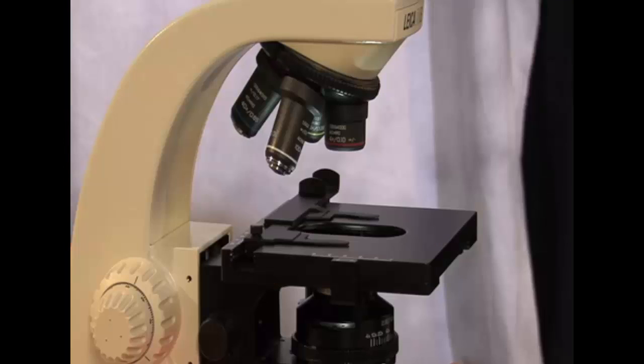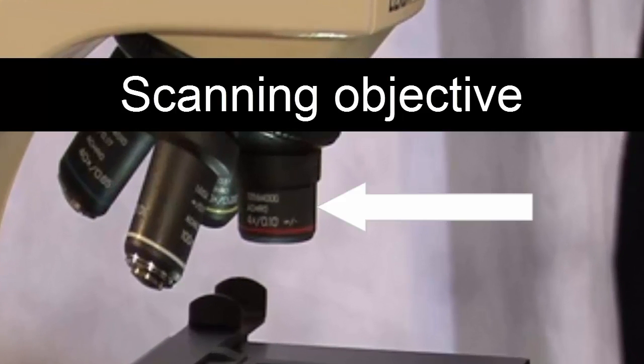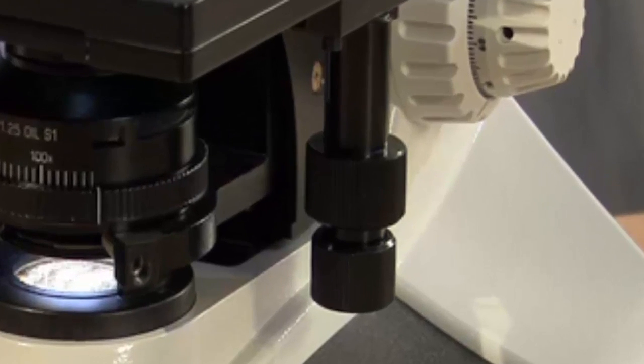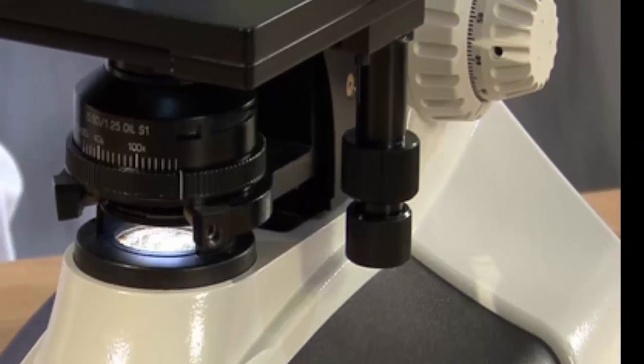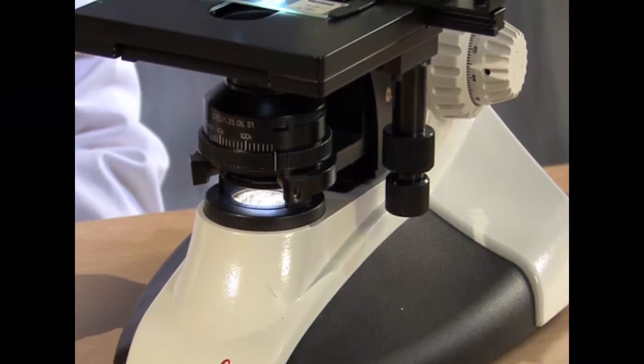Next, make sure the stage is in its lowest position and that the scanning objective is in place. Find the mechanical stage knobs and move the stage forward to allow room to place the microscope slide onto the stage.